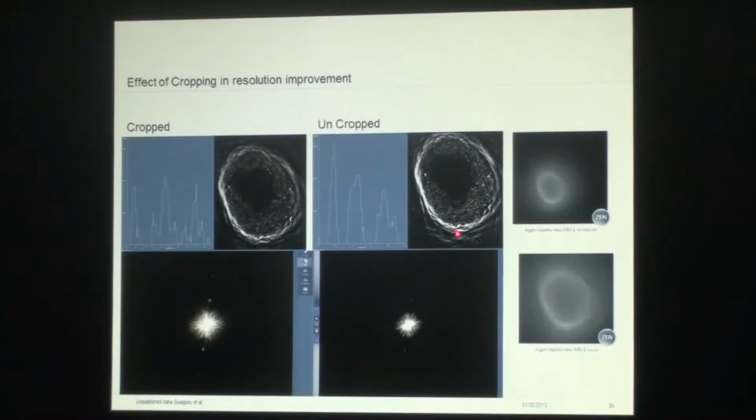And then the cropping function, some people wanted to do the processing very quickly. So you take an image from the total field of view, and then you crop only the sample and do the processing. When you do the uncropped image, because of the frequencies, it has an ability to calculate the background from the signal to noise, the gradation is much greater.